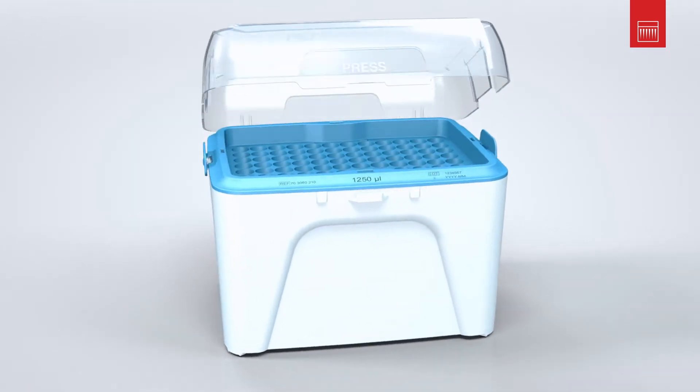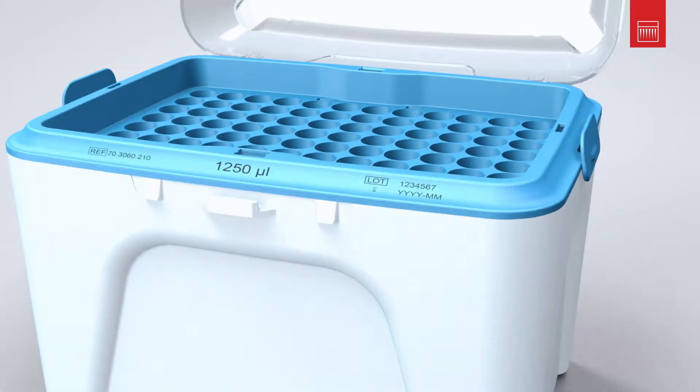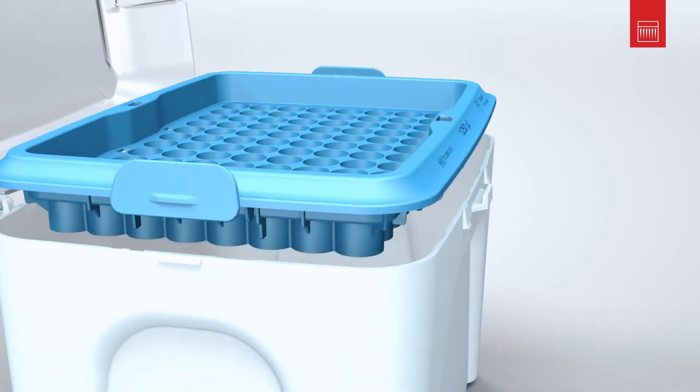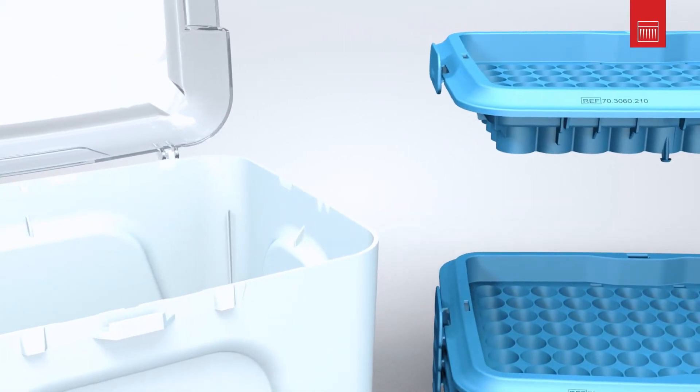The empty tray can easily be released from the box by pressing on the two side clips at the same time. You don't need to hold the box for this. Your box is now ready to be refilled quickly and easily with the Sarstedt single refill or from the stack pack.